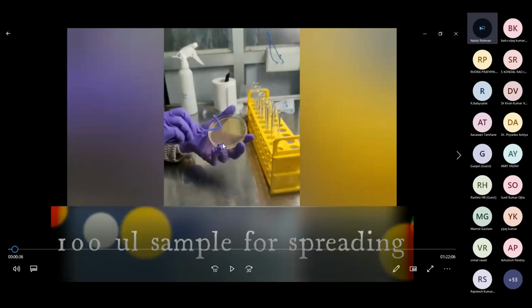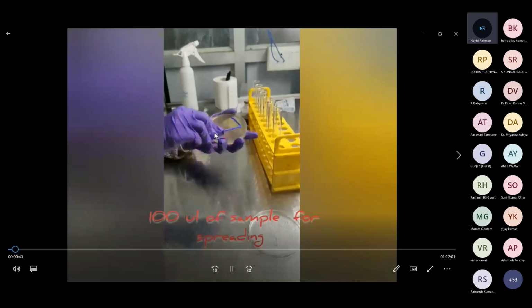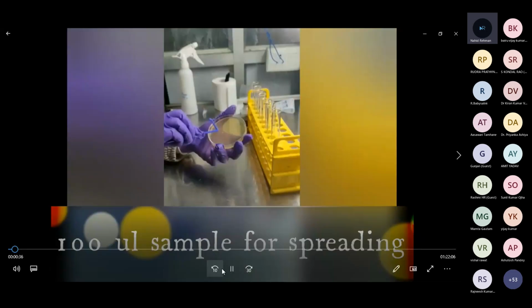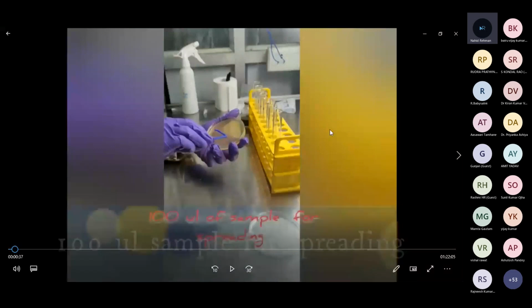So you have to spread that diluted culture over this plate. So what will happen after spreading? You will cover it with the lid. This L shaped thing is the spreader. So she will just cover it and then put it in the incubator. The incubator provides the specific temperature, and also there is no interference of outside air.